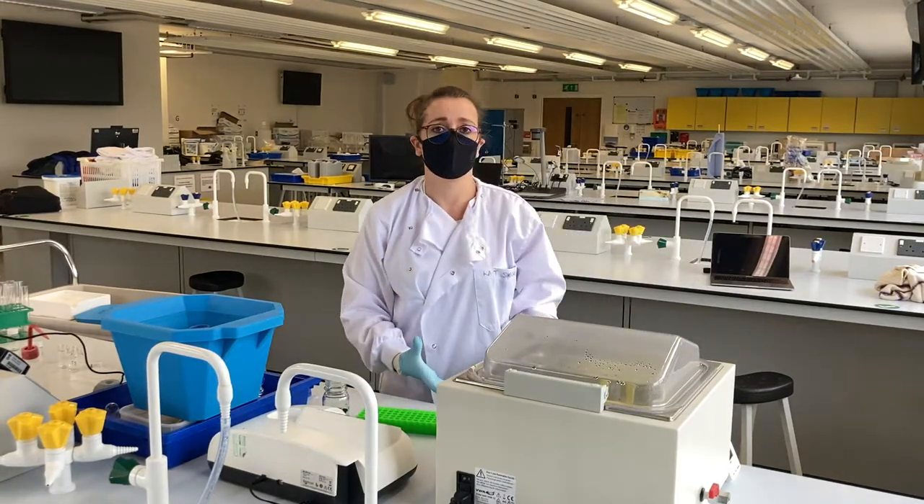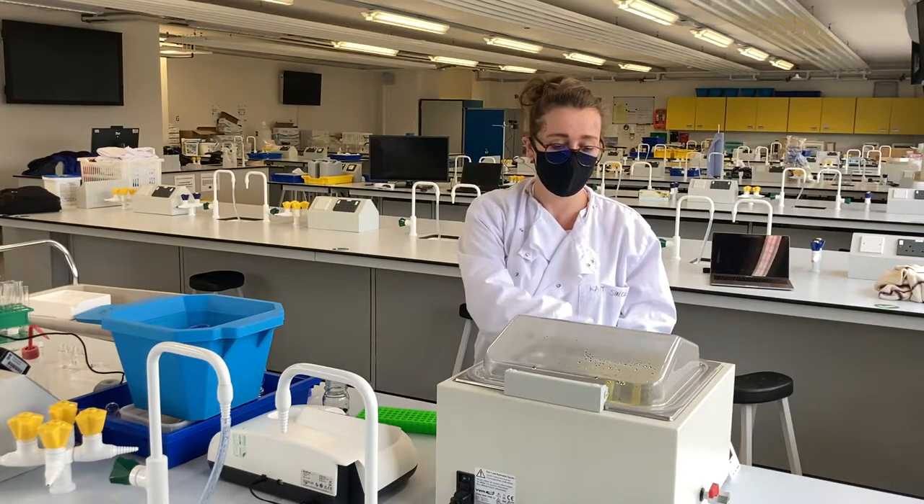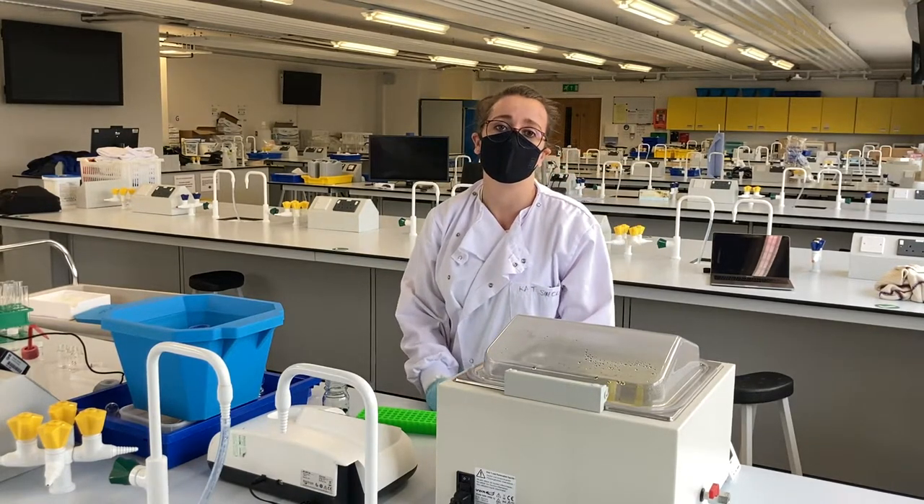Once they're brought up to the right temperature, we mix the two tubes together and place them back into the water bath until the incubation is complete and we're ready to take our reading.